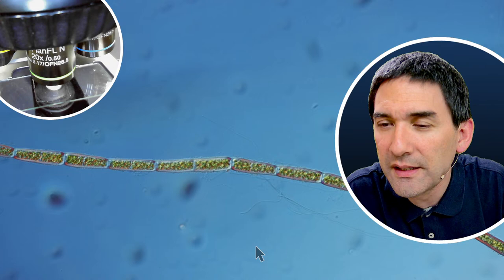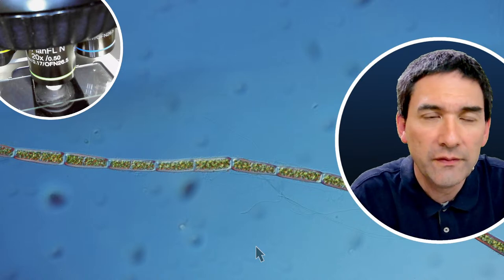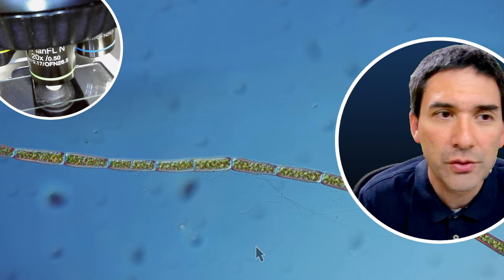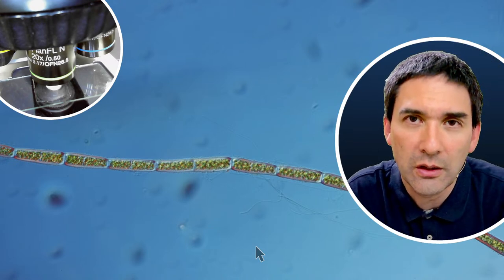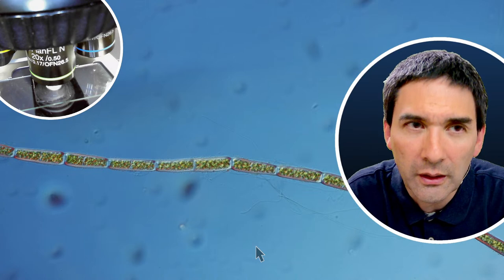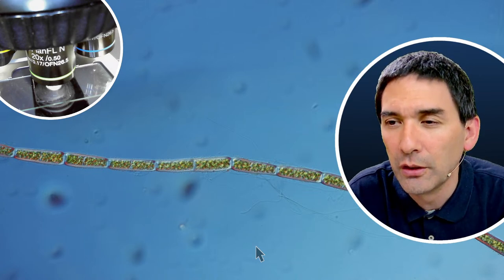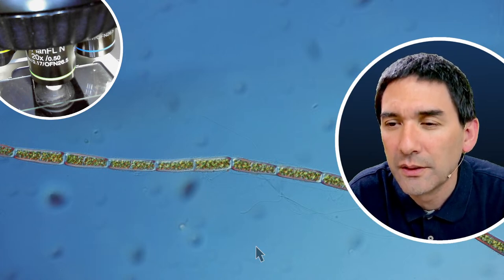What brand is this microscope? I only see it being used during your live streams. Well, I also use it for my regular videos. It's an Olympus microscope. I would say that the brands generally are not so important. It really depends more on which type of specific microscope model serves your purposes best. Okay, but that's also an Olympus.